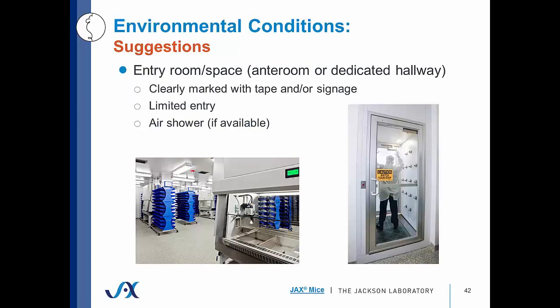And finally, the environment can also play a role in spreading pathogens to the NSG mouse. That's why we suggest that you have an entry room or a space, whether that be an anteroom or a dedicated hallway, that's clearly marked with tape and or signage and that also has limited entry, because you want to reduce the ability for pathogens to be spread to NSG mice from the number of personnel entering. And finally, if you have this available, we recommend using an air shower, and that's something that we use in our facility.